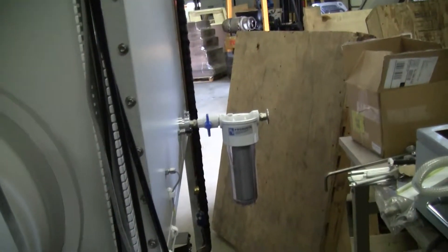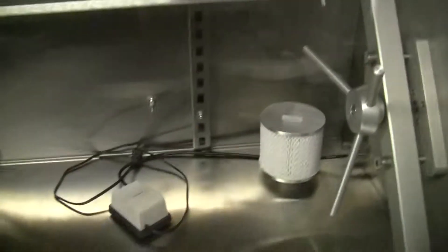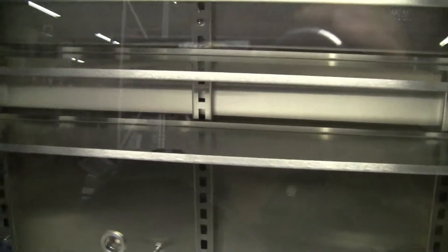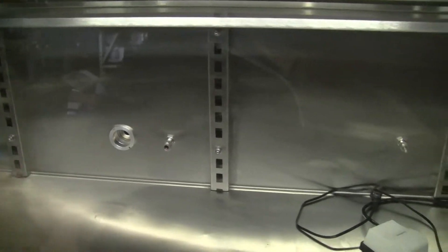Out of that back accessory chamber. What is missing, if anything, is 115 volt power inside the box. Three shelves. My belief is that the port that we're looking at now was the electronics port coming out and they had a bar attached to it, a power strip bar.